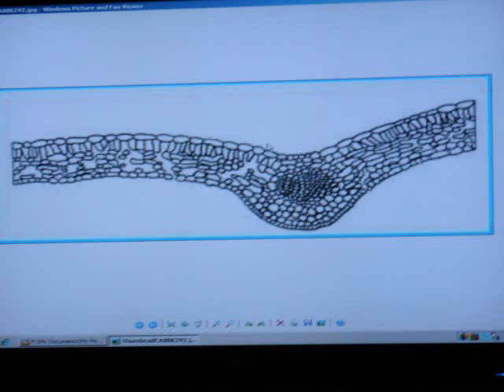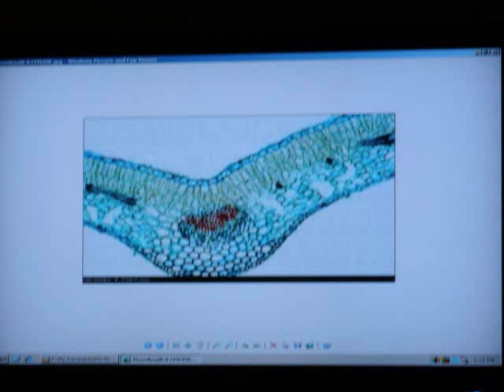This in here is a lot like what we have over there. On this picture, now there is your vascular tissue. Now, what is this part? That is the xylem. And what's that part? The phloem. What's the whole thing called? Vascular tissue or vein. Okay.